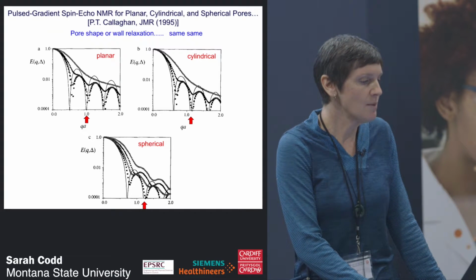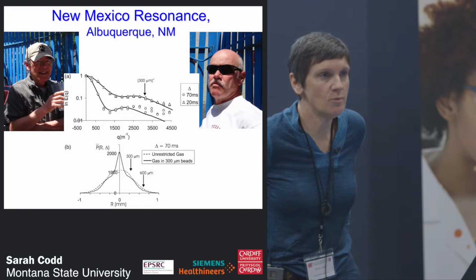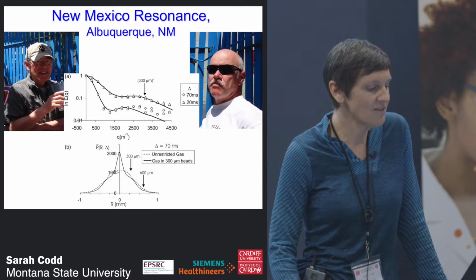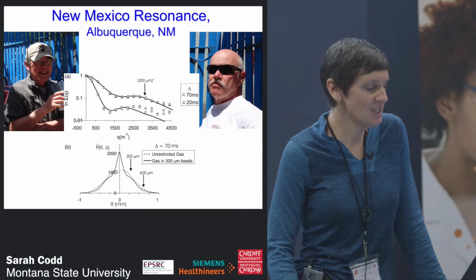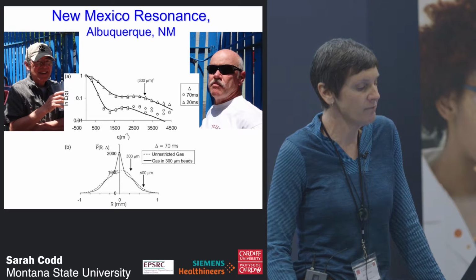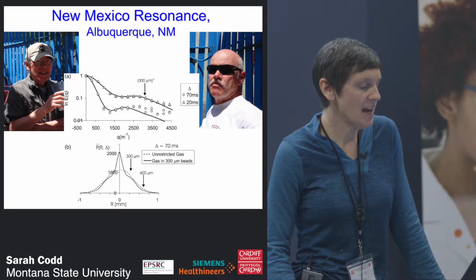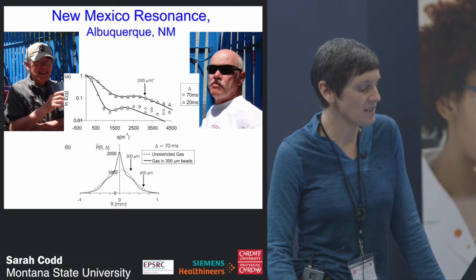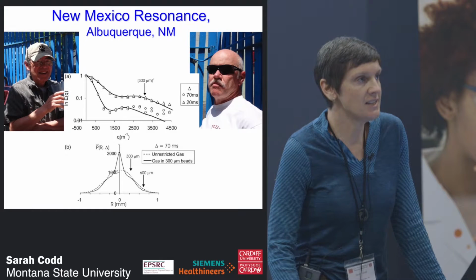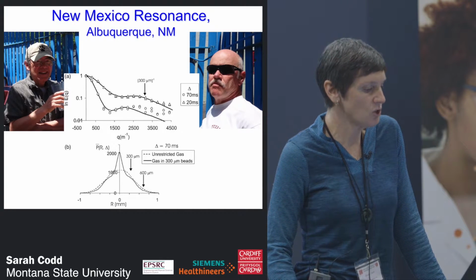Well, after working with Paul until about the year 2000, I moved over to New Mexico Resonance and worked with Ichi Fukushima and with Steve Altabelli, and continued the work. I'd enjoyed this idea of collecting the full experimental data in the Q space and then Fourier transforming it and getting the propagators. And in some porous media there, we looked at gas diffusion as a way of increasing the time and space windows that you can get access to.